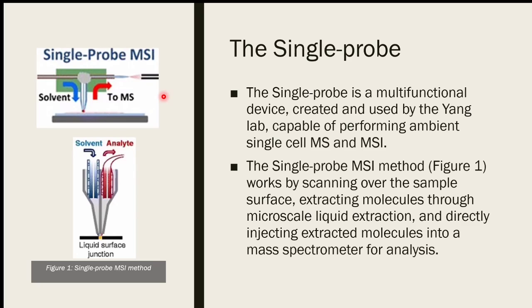No, that's fine. This, like I said, is an interesting technique because I'm familiar with mass spec and even a little bit of mass spec imagery, but this is a new one to me. So I'm really interested in it. So yeah, this one's an ESI. It's an ESI emitter over here.